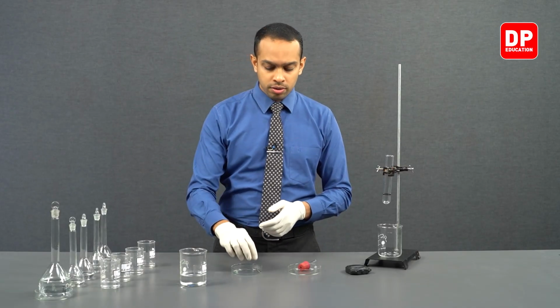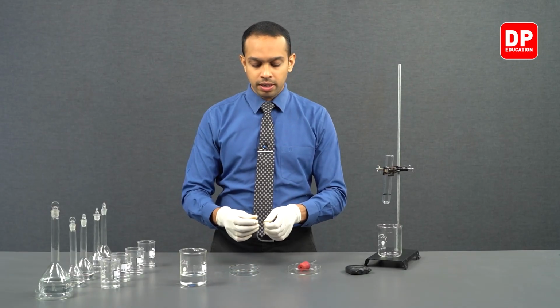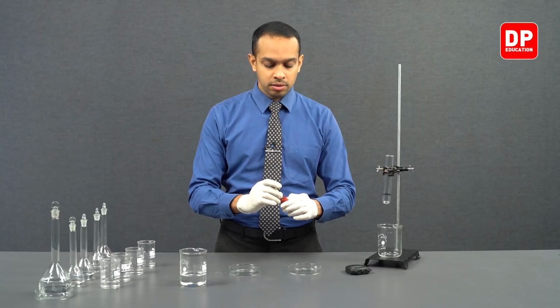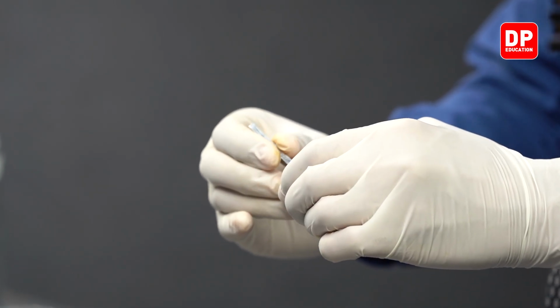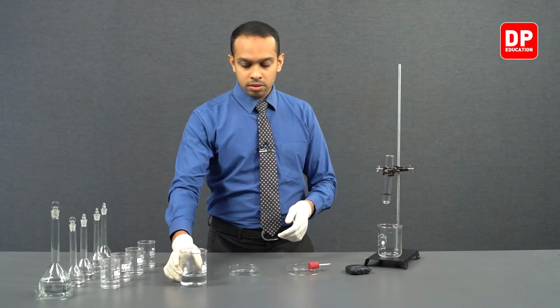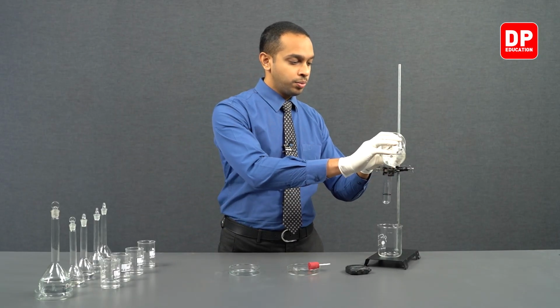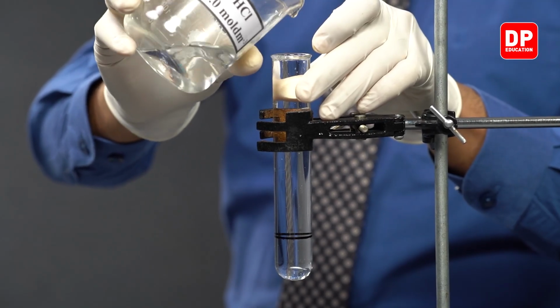Now students, we can take our final strip of magnesium that we have with us here, and we will be placing it again on our rubber stopper. We will place it securely, and then we will be filling our boiling tube all the way to the top.